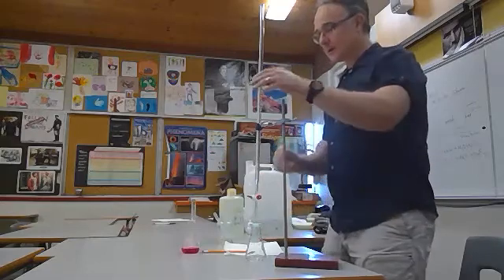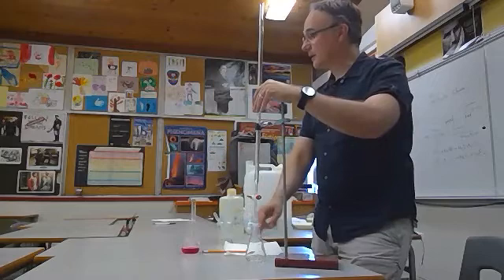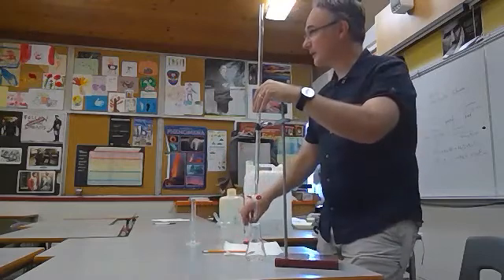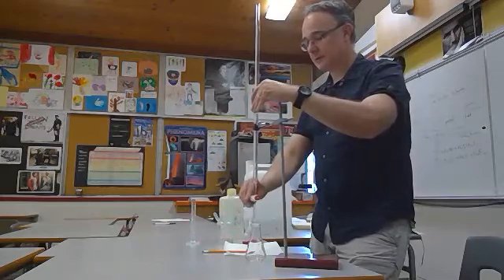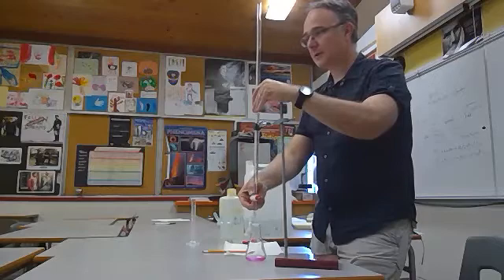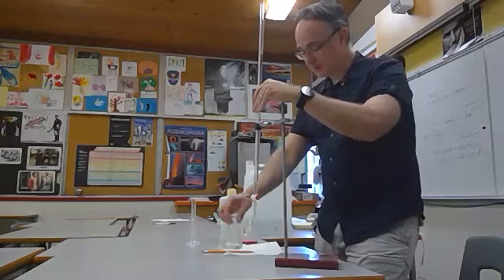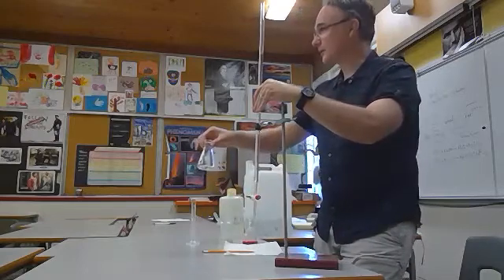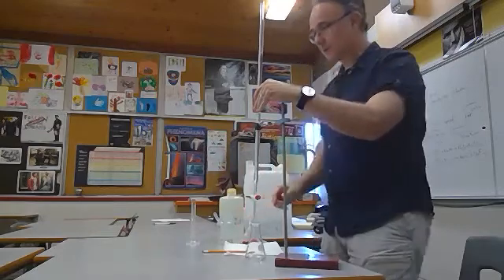So I'm going to add 5 mils at a time. You can see as I do that, it's going to turn pink, and it goes pink again. So watch that. You see that pink forming there. That's almost 10 mils of base. That's quite a bit of base. Then I give it a swirl, and it completely goes back to being clear again. So that equivalence point is reached pretty quickly here.